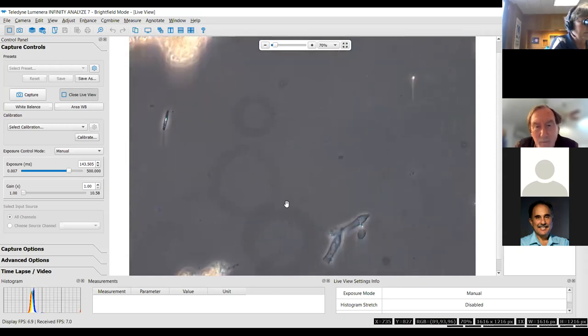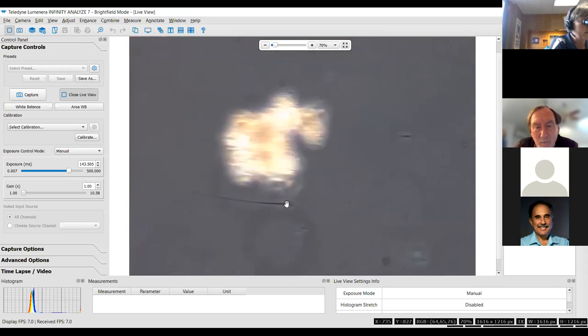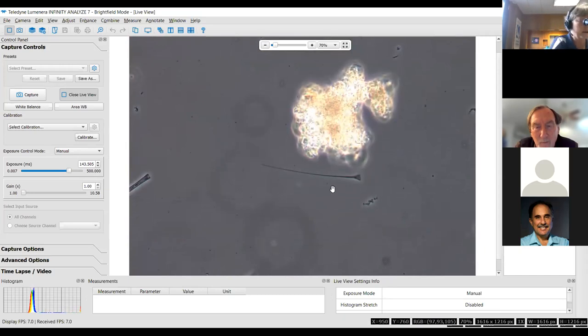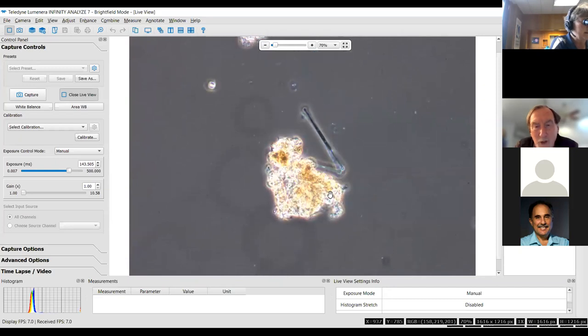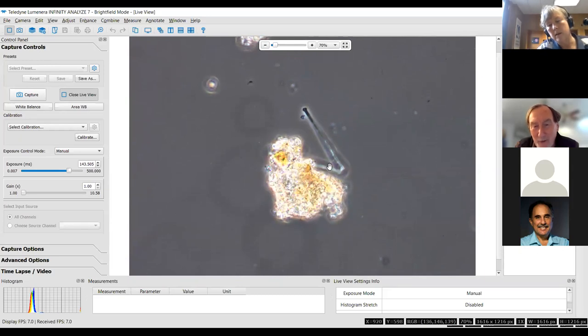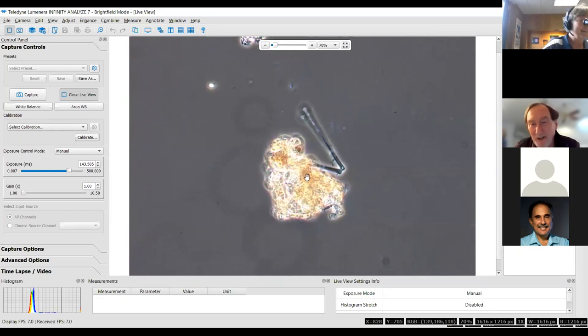And then remember that all of the chrysophyta to some extent, and this is off of a Uroglenopsis or a Uroglena, have some sort of silica, right? So even the Dinobryon has silica in the lorica. You should show that you know that. That's the big blob there, that's crap, or it might be crap lumpus. I always mix up those species, but there's going to be a lot of stuff that looks like it might be algae and is not.